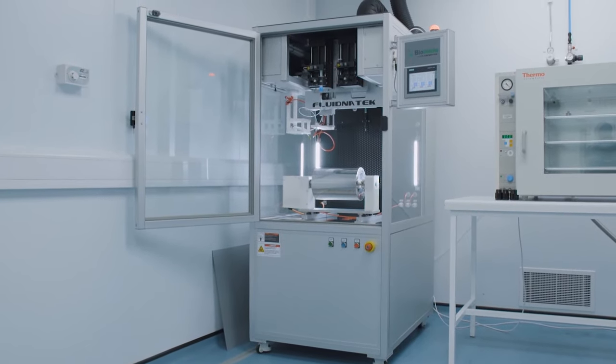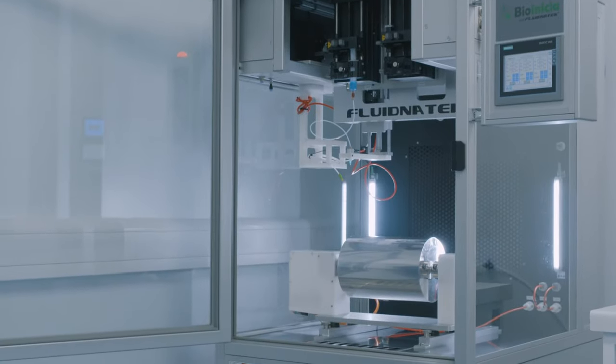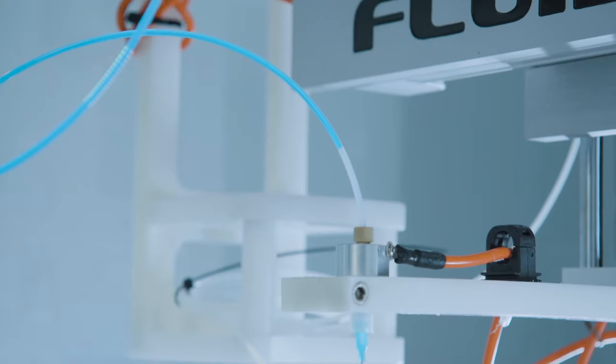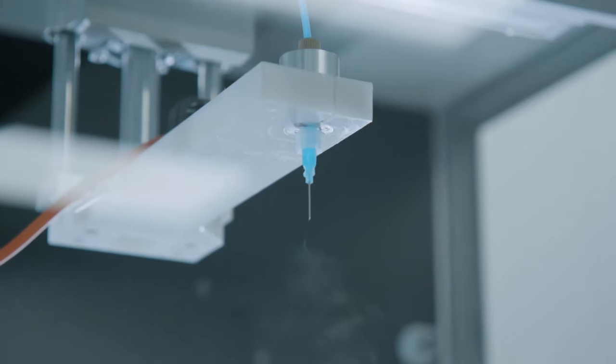Electro-spinning is an established technique for the manufacture of fibrous components for medical devices. During electro-spinning, a syringe pump feeds a viscous solution through a needle, which is connected to a high voltage, ejecting a thin jet of the solution.